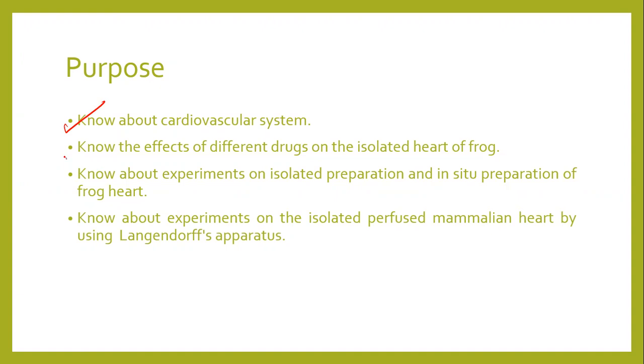The second purpose is to know the effects of various drugs on the isolated heart of frog, to know about experiments on isolated preparations and in situ preparations of the frog heart, and to know about the experiments on the isolated perfused mammalian heart by using Langendorff's apparatus.